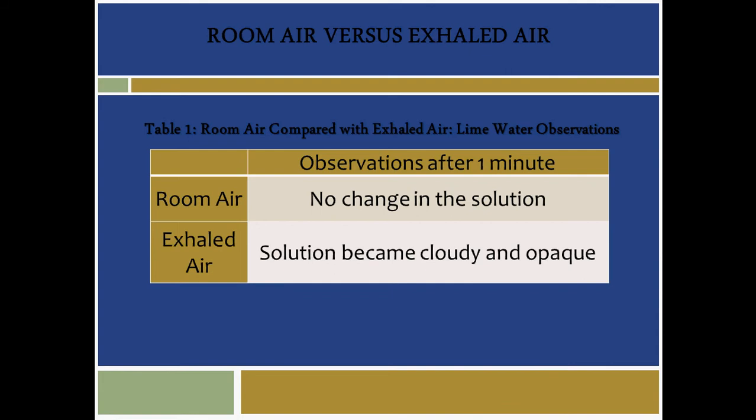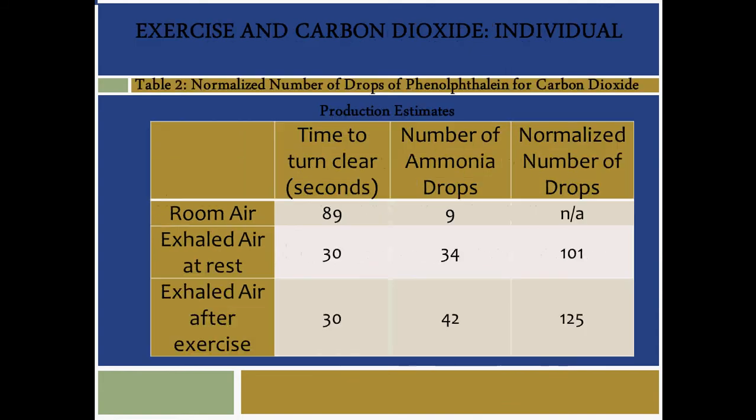Exhaled air had a larger concentration of carbon dioxide than the room air. This indicated a difference in the amount of carbon dioxide under different conditions. The effect of exercise on carbon dioxide production as compared to normal exhalation at rest was observed as well.